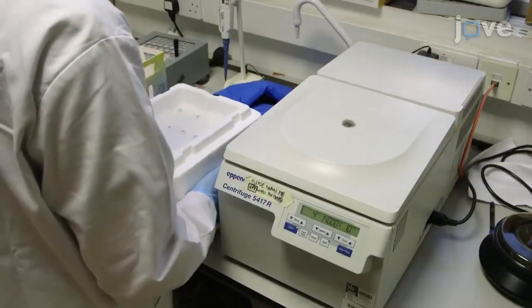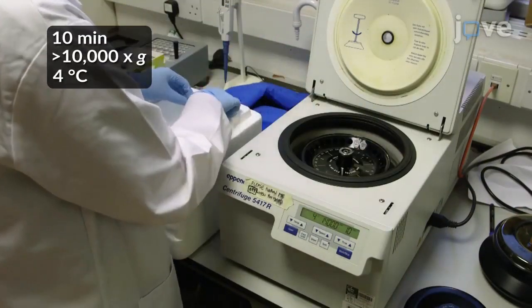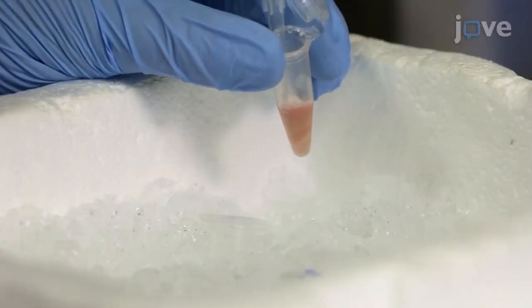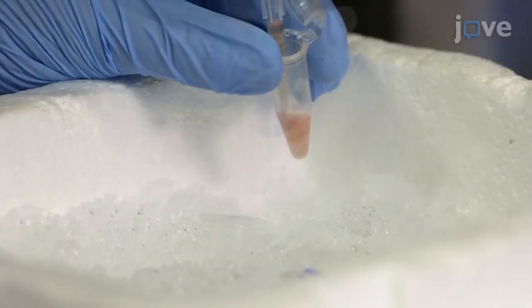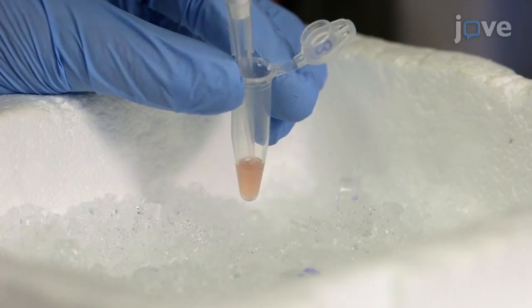Leave the samples on ice for 10 minutes, followed by centrifugation. Then transfer the protein sample containing supernatant to a new tube on ice without disturbing the pellet.